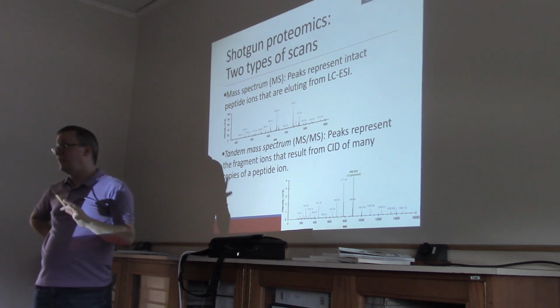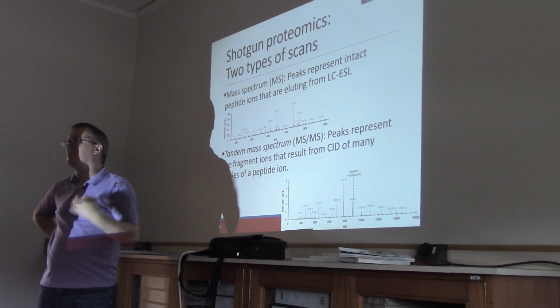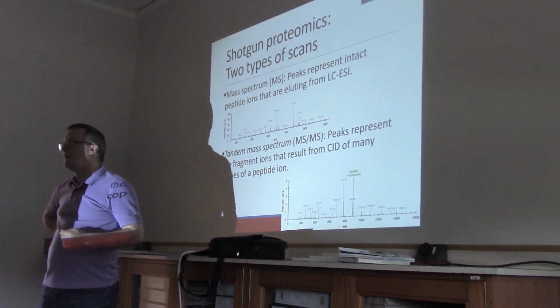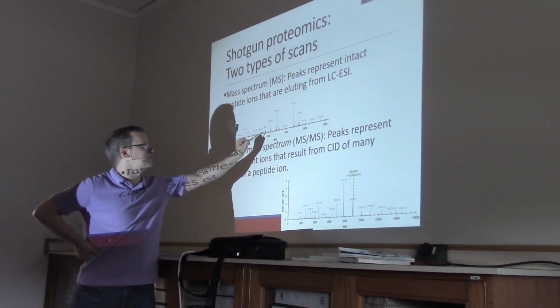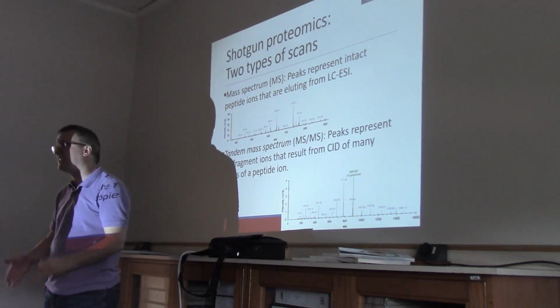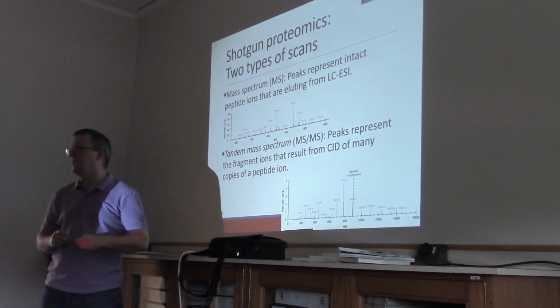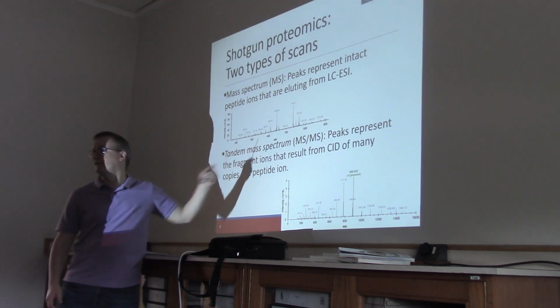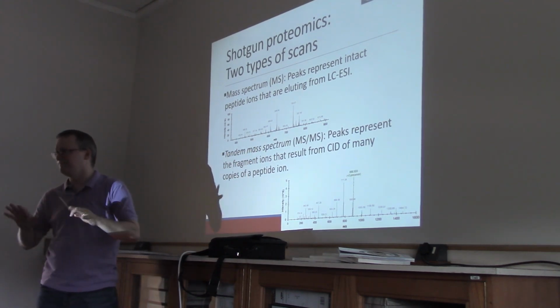That is a wrong inference, because each ion has a different kind of potential for ionization. Right? If you have 1,000 copies of whatever this is and 1,000 copies of whatever that is, you've no guarantee that they're going to produce similar spikes on our mass spectrum. So generally speaking, we can only compare this signal for 582.97 with another signal for that same peptide.